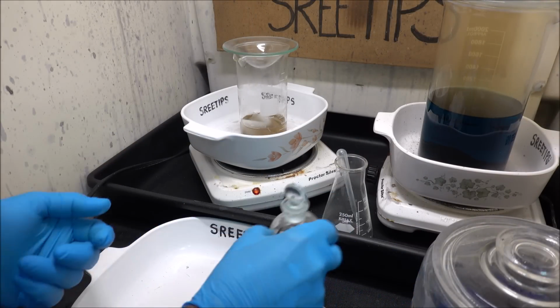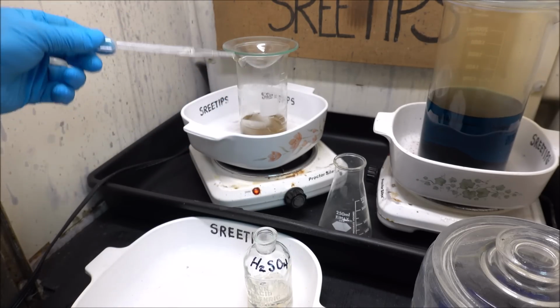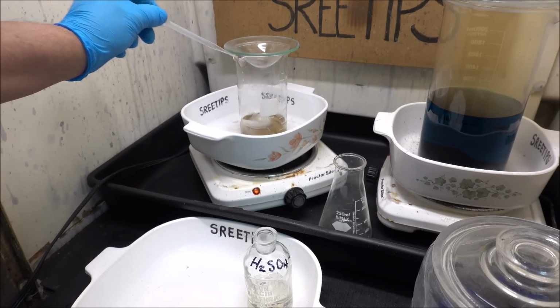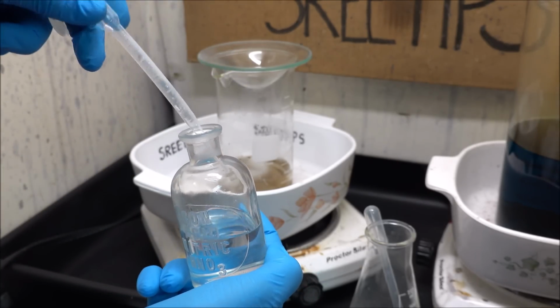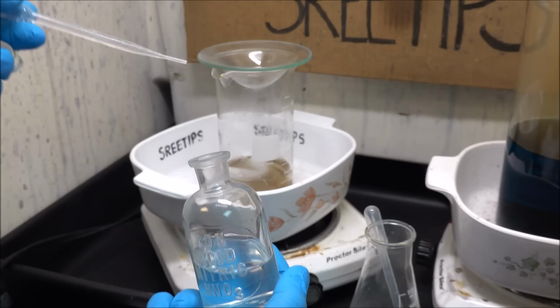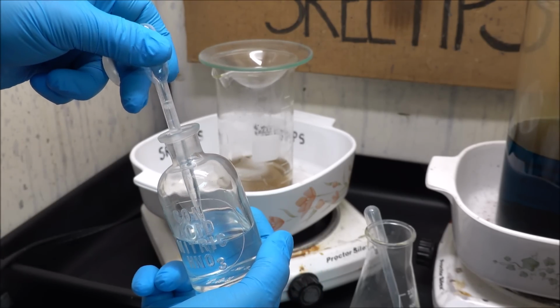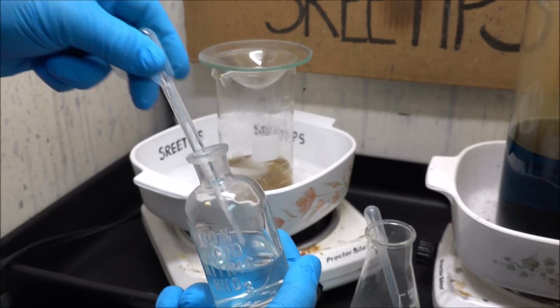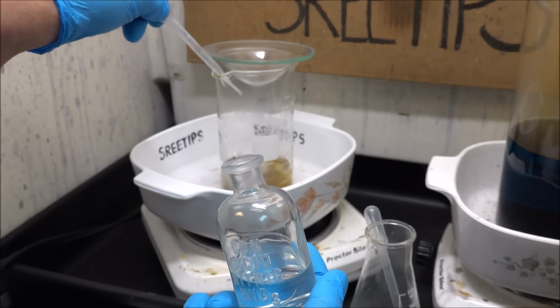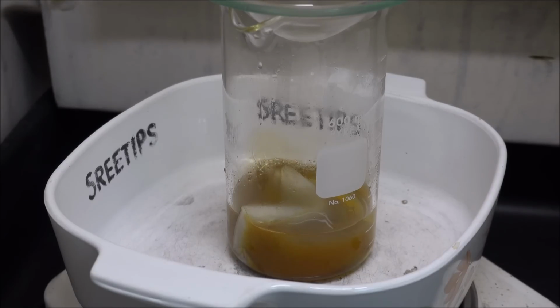As before, I'm going to add about 1/2 milliliter sulfuric acid here, just in case there's any lead present. Now I'm going to add some concentrated nitric acid here. That's about 9 milliliters. Just let this dissolve.